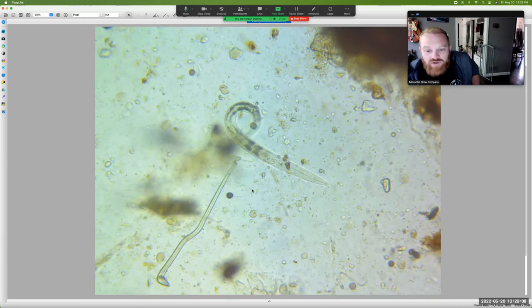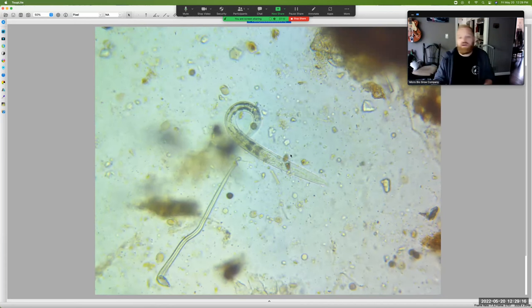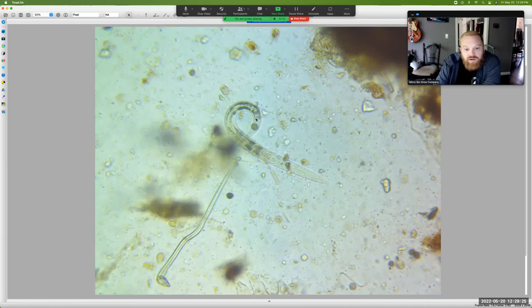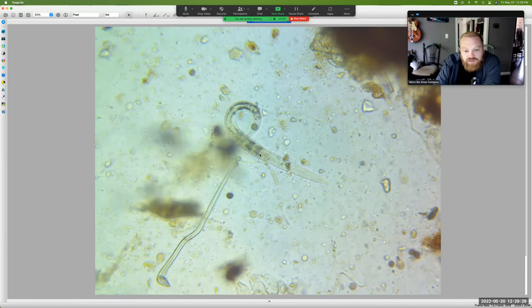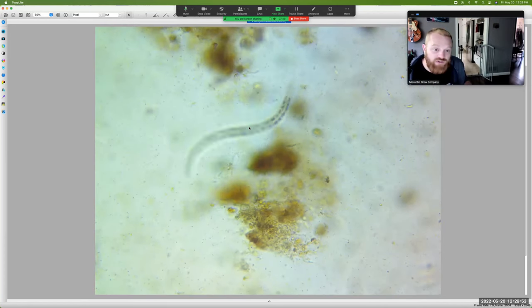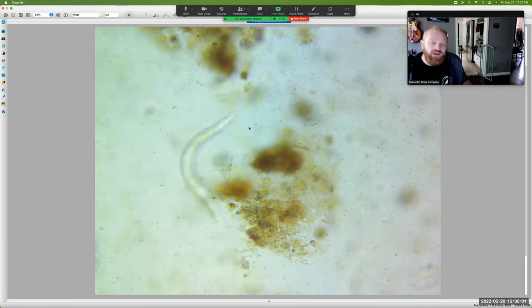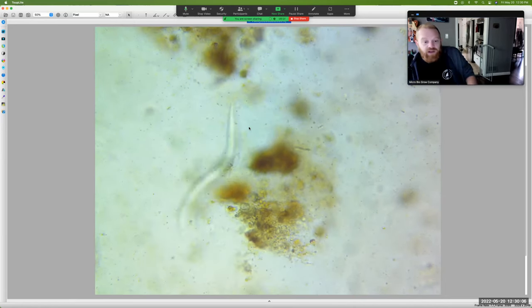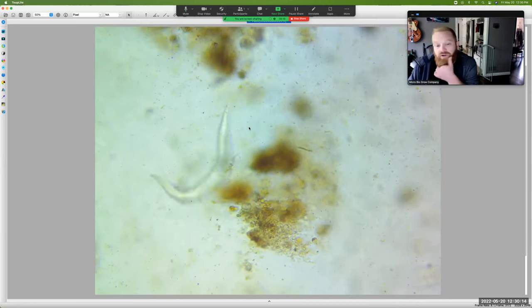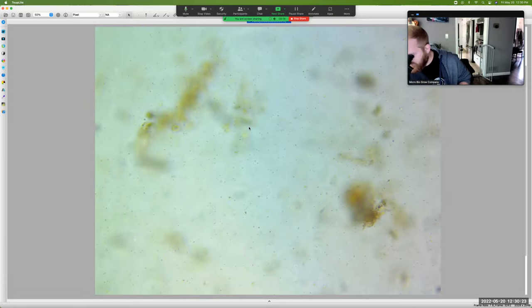He slowed down and took a break. You can see he's got a median bulb and a terminal bulb — he's got that heart valve and straight stoma. That's a bacterial feeder right there. You see all this bacteria in his lower intestine — this is where his intestine starts and he comes down through. This could be a female; that's potentially an egg but I can't tell. You can see the terminal bulb pumping away — that's a bacterial feeder as well. He's eating all the bacteria in this soup he lives in.